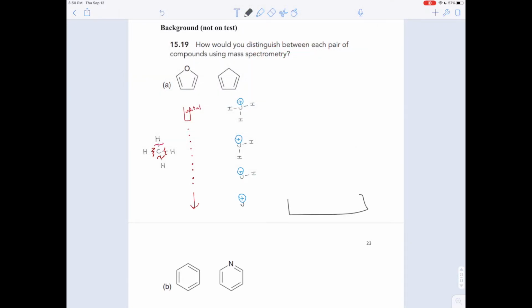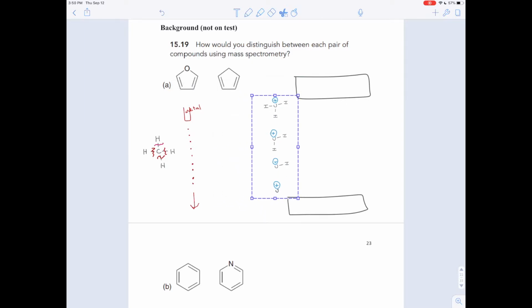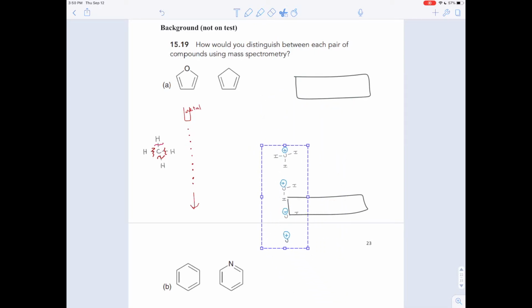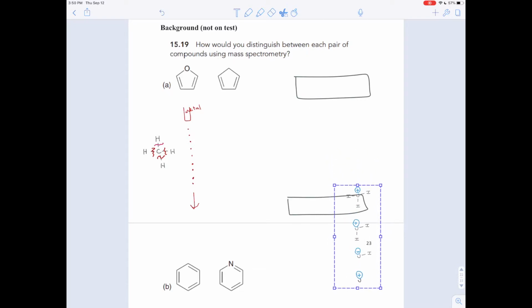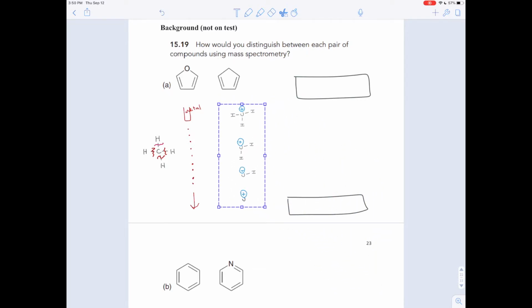So you'd have magnets here and magnets here. Now, anytime a charge moves, it creates magnetism. So moving charges respond to magnets because they have magnetism associated with them. So when these pass through the magnets, they'll turn. Instead of just going straight and keep traveling, they'll turn because of the pull of the magnets.